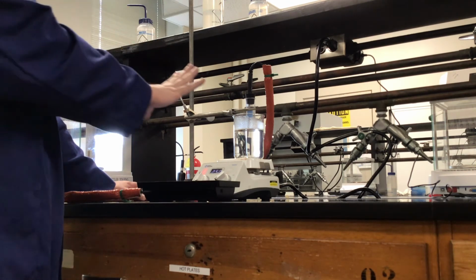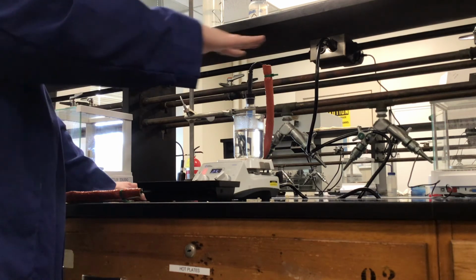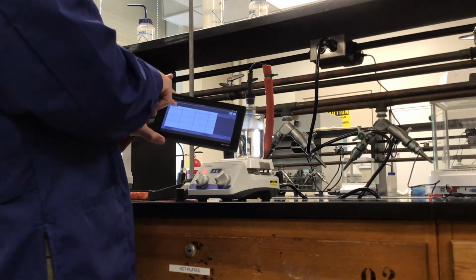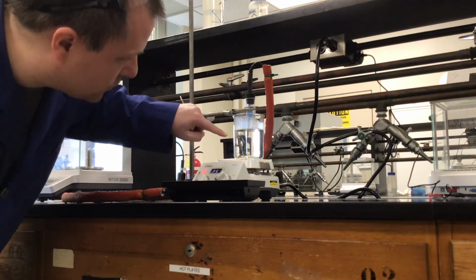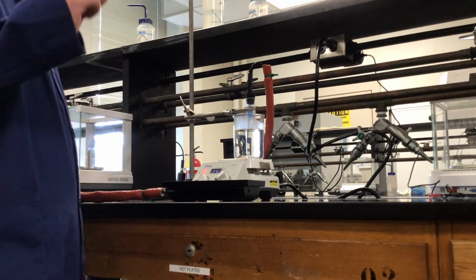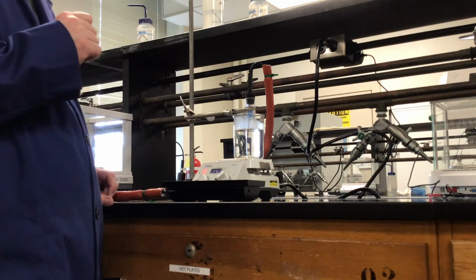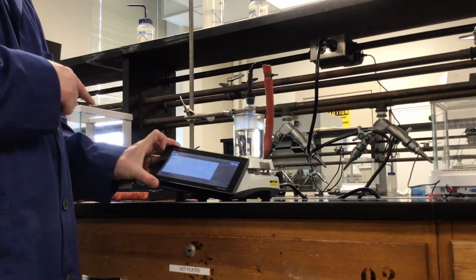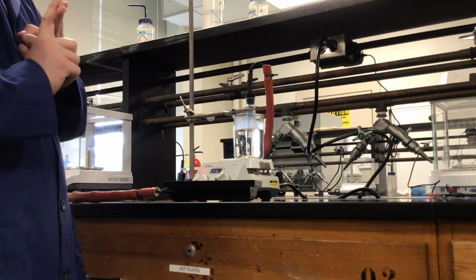But as we measure the temperature of our solution, we're going to look for where the plateau is on our actual probe. You can already see this starting to slow down a little bit. My temperature ramped up and now it's starting to flatten some. And if I look in the solution down here, it's probably going to start to bubble before too long. We just want to look at when we get bubbling inside our test tube, and when we see a nice, very flat plateau for our heating curve from the LabQuest. Those are the two main things that we're looking for.